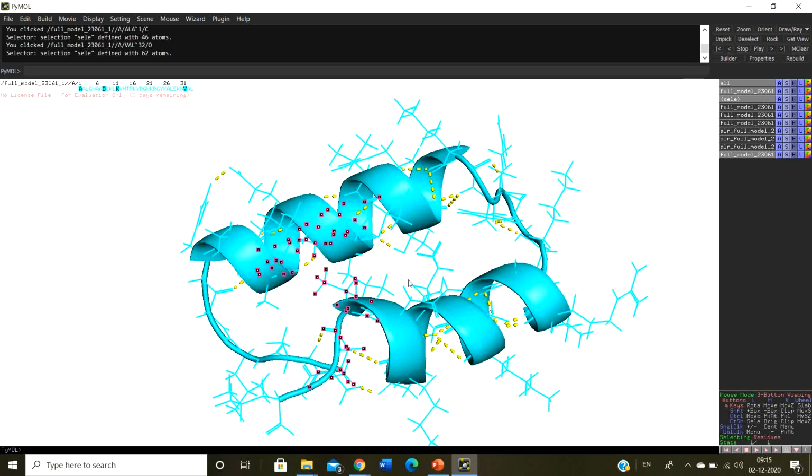And sometimes, suppose you have two complexes, okay, you have two proteins. But if you do it on a large protein, you are going to find multiple yellow lines, right? And that's really difficult to understand, what is interacting with which, because to make sense of this hydrogen bond, you have to select the stick option, right?